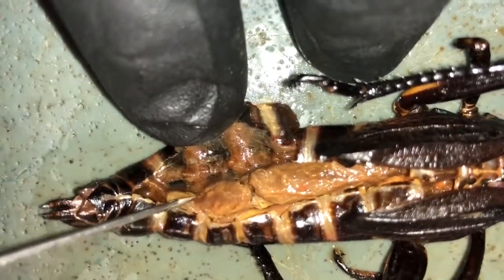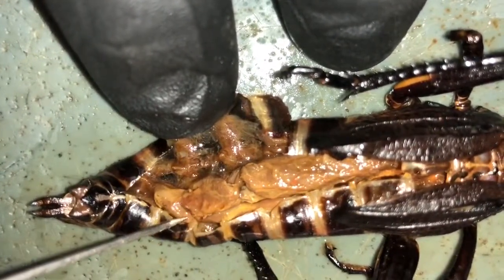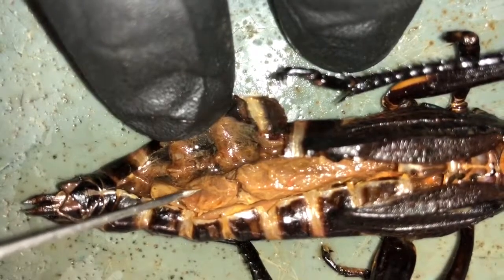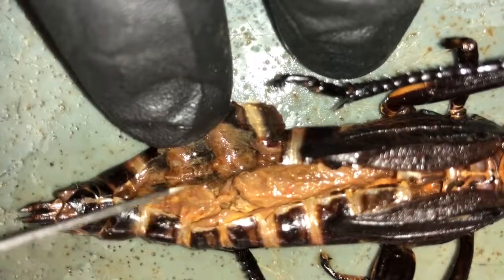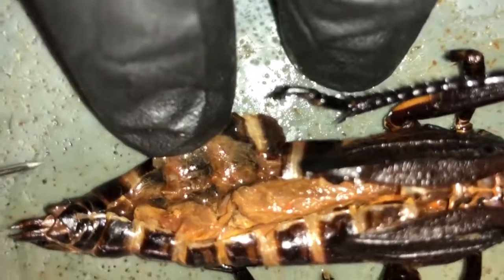And you saw it right there. See it sticking up as you push? Go ahead and push, real soft, and you see it. It's like sticking out, like this thing right here. See the connector between that mass and the body wall? Right here. Watch. Go ahead, pull, and it'll stand up. See it stand up? Well, it's not there anymore, but it's like a little membrane. It's a channel too. We'll show you on the video when it comes back.